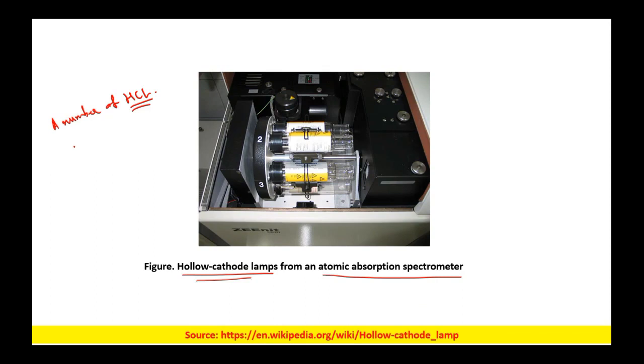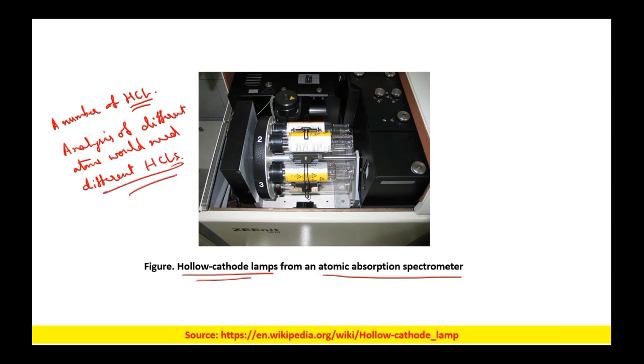So analysis of different atoms would need different hollow cathode lamps. This is one of the important things. Okay, so this is the thing. If you see, there are a number of hollow cathode lamps which will be there.